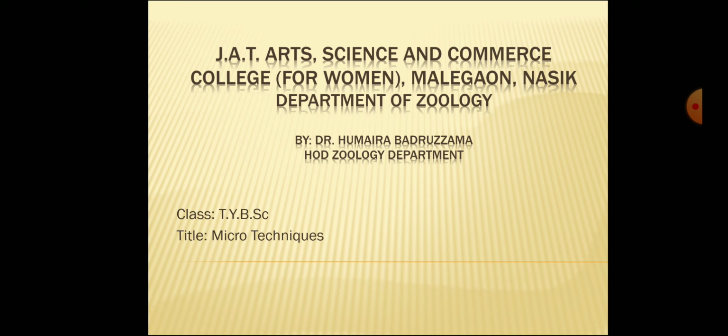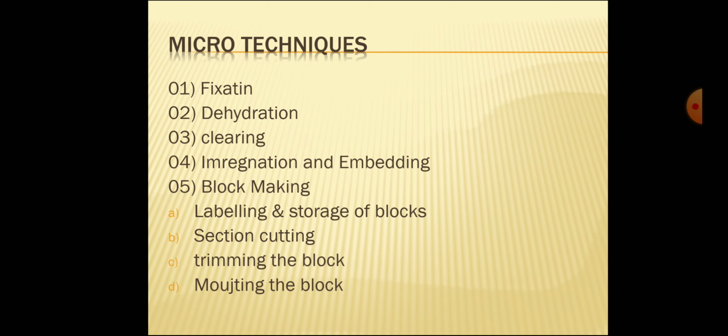Other fixatives are used according to their action upon the cell and tissue constituents. So fixatives are also classified as microanatomical fixatives, cytological fixatives, nuclear fixatives, and cytoplasmic fixatives.